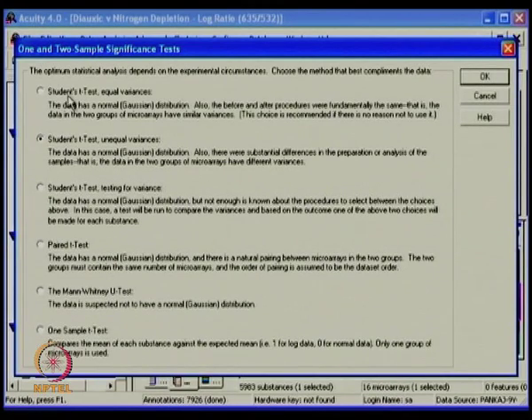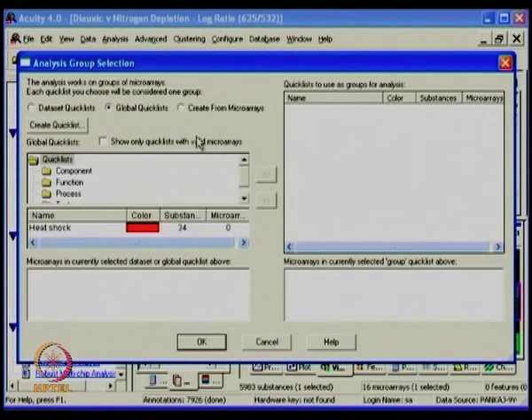Based on the right kind of design, one will select the different kind of statistics available and perform the analysis. One needs to look at their experimental design and then select the right statistical parameter for further analysis. In this fashion, it tells you that I have different kinds of data sets which you want to select. So I select them and group them according to 0 and 1, like all cases and all controls, and then I perform the analysis. So let's quickly do that.